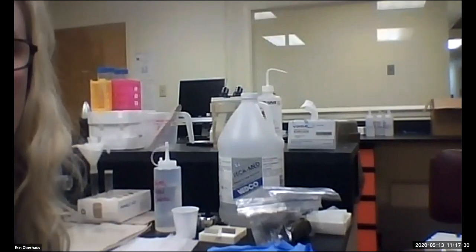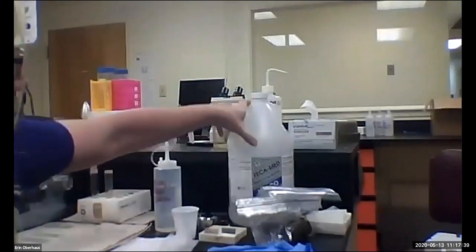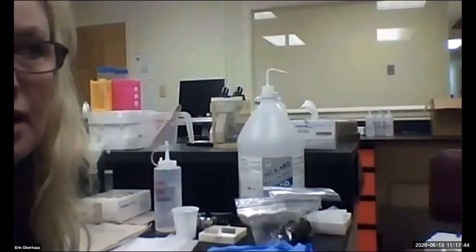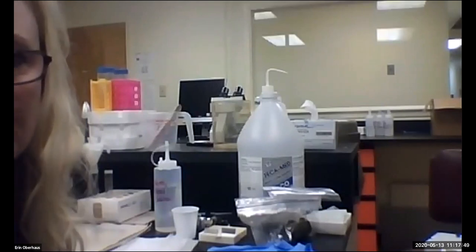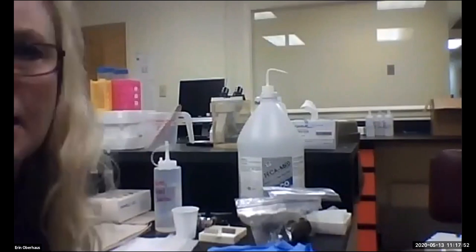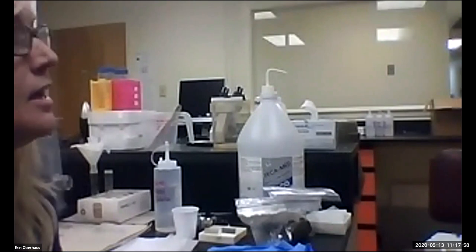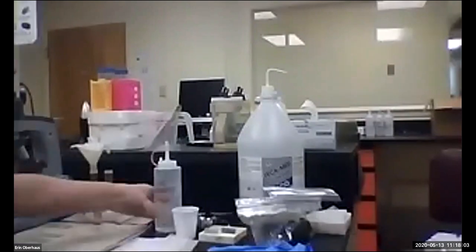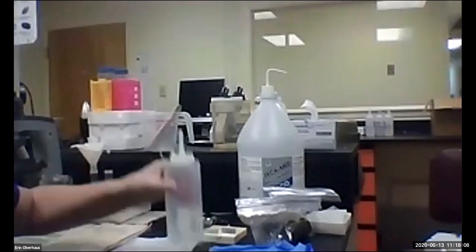There are a lot of different fecal solutions that are available commercially, and you can actually make some at home on your own if you're so inclined. I have here a sodium nitrate solution, and all of this is available online. You don't have to have any kind of special credentials to purchase any of these materials. If you want to make some at home, you can use a sugar solution, or a magnesium sulfate or Epsom salt solution. If you're interested in any of those recipes, I can provide some resources to Dr. Walker. But I basically put some fecal solution in a little squirt bottle.